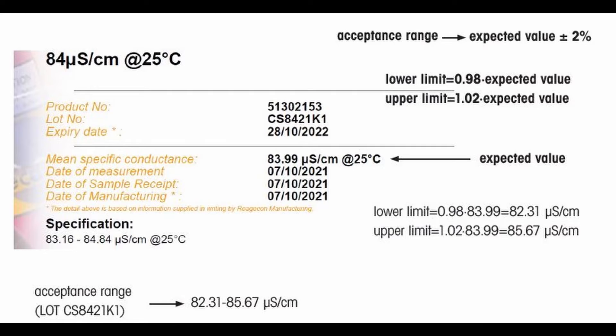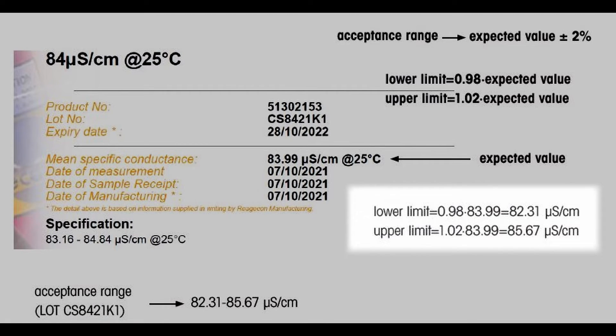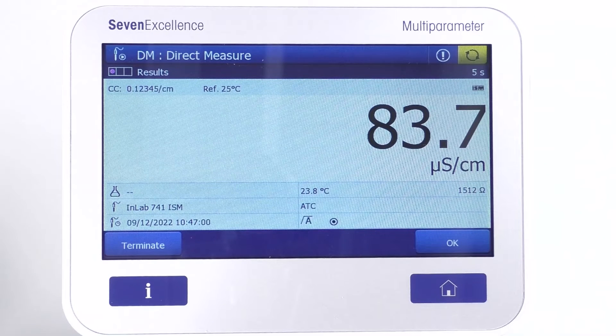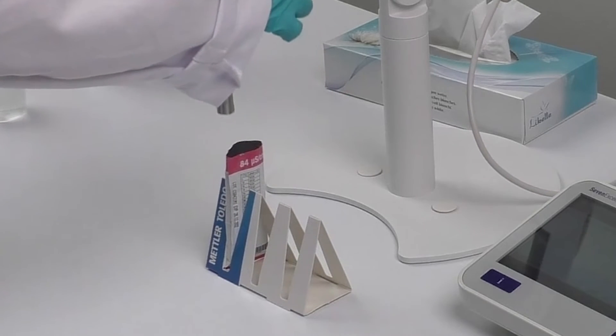Grab the quality certificate of the standard. From here, take the mean specific conductance and calculate the lower and upper limits based on the example provided. After performing the verification, you can see a value of 83.7 microsiemens per centimeter in this example, which is within the required range. This means your verification has passed successfully.